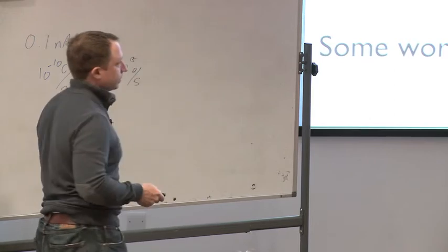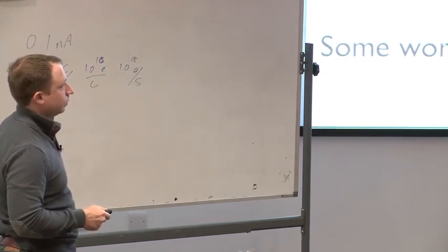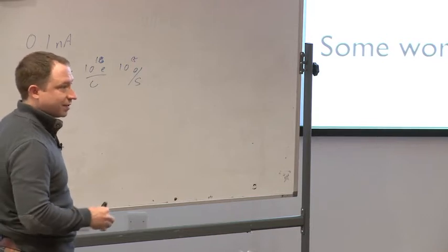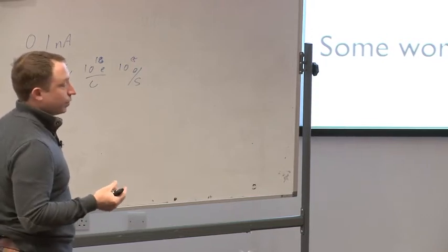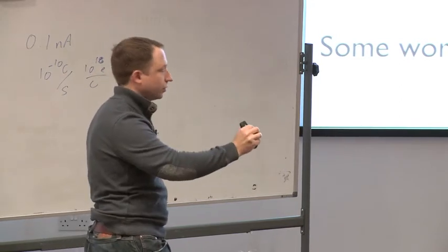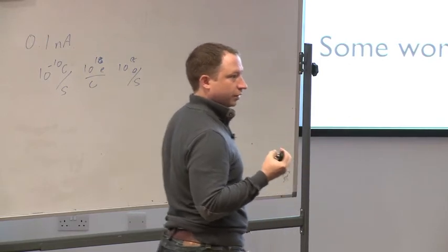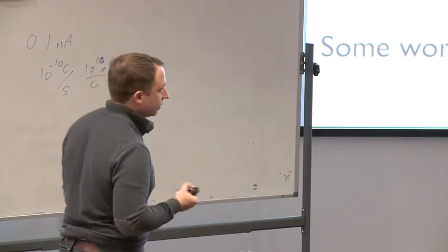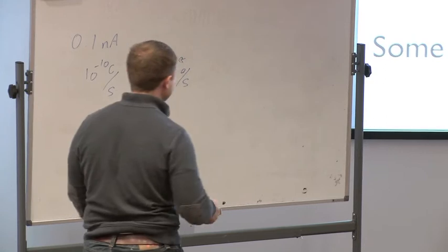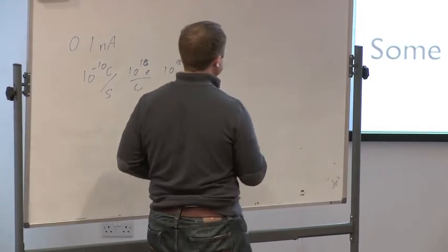Because at 3/4 of the speed of light, the electron is twice as heavy as it would normally be, right? Its mass increases. Not only that, but time slows down. So if you had a clock that was traveling along with your electron, that clock would run at almost half the speed of a normal clock, right? So it's really mysterious stuff going on here when you go to these high energies. So it's a bit crazier than you think. But anyway, we can still do a simple calculation.